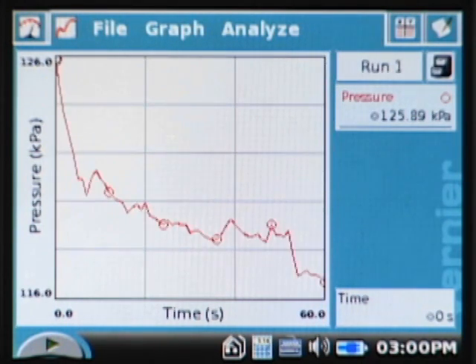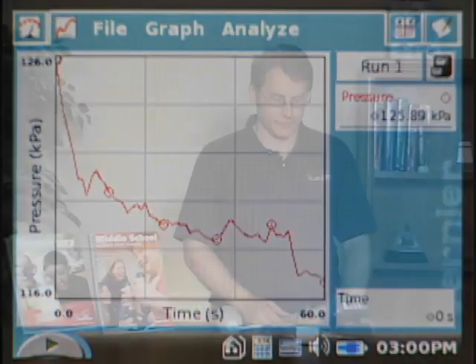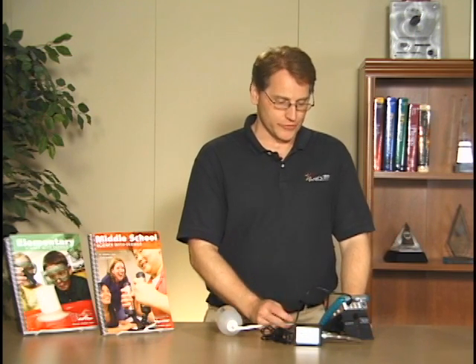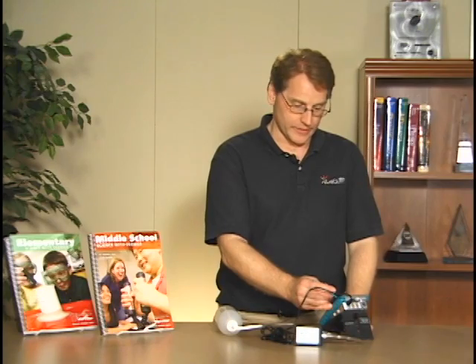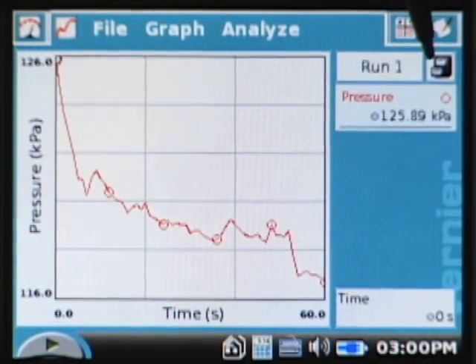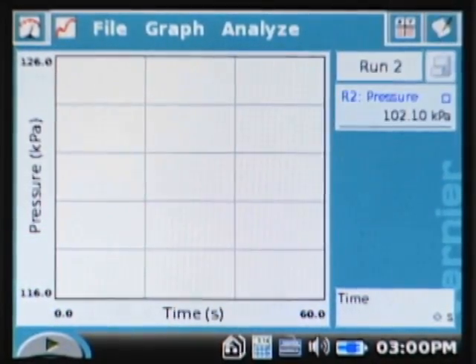Okay, when I'm done, the LabQuest auto-scales the graph, so it just kind of changes the scale so that we can observe the graph in a little greater detail. Now I'm going to switch hands and use my left hand, but I want to keep my first run, so I'm going to go over and tap on the store button right here—there's the little filing cabinet—so that allows me to store the run.